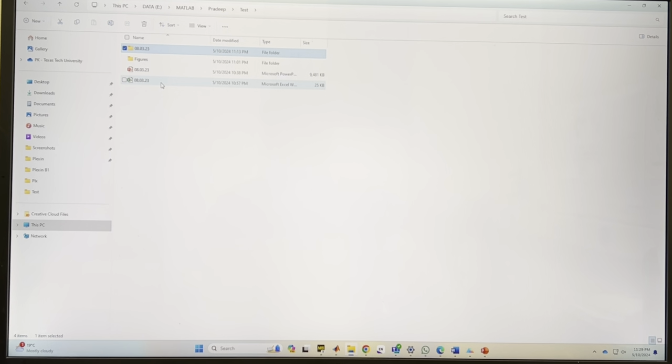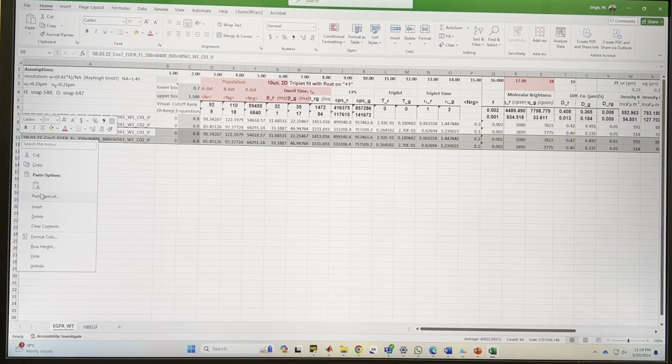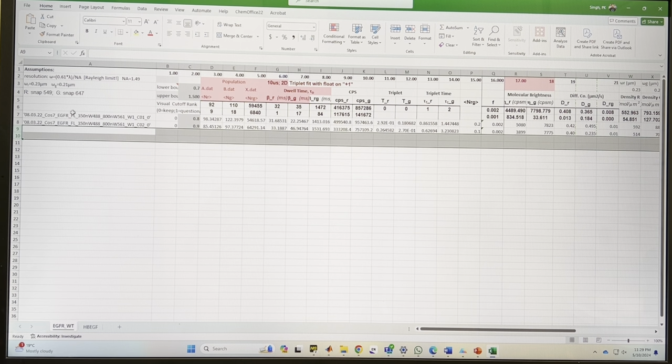Okay, so I made today's Excel sheet. Let me open it. We have already set the parameters in this Excel sheet. If you have an old Excel sheet, you can just delete the old readings and leave 2, because this is for standard deviation, so we need at least 2 from the old, but I'm going to replace that one with the new data point.